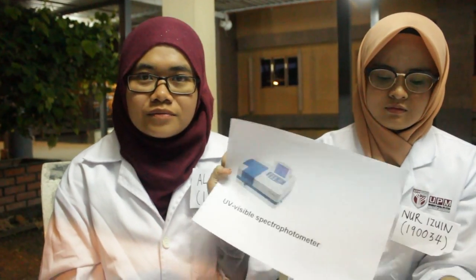Okay, I will add some to what has been said. A spectrophotometer is an instrument that measures the amount of photons, the intensity of light absorbed after it passes through the sample solution. With the spectrophotometer, the amount of a known chemical substance, which is concentration, can also be determined by measuring the intensity of light detected. Depending on the range or wavelength of the light source, it can be classified into two different types. One is the UV visible spectrophotometer, which is this one.